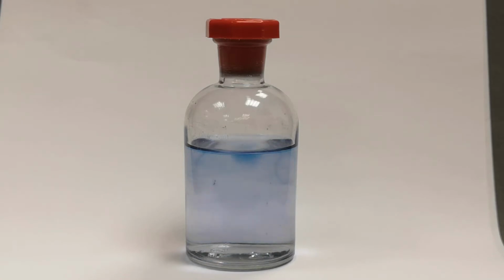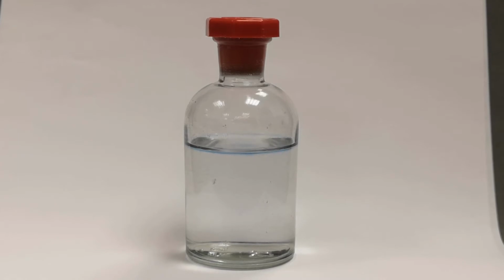If you shake the bottle though, it goes blue again. Oxygen in the bottle's headspace, above the surface of the solution, dissolves in the solution and then reoxidizes the methylene blue back to its oxidized form. On standing again it goes clear, and you can keep on shaking it and letting it stand for a fair while as it switches between blue and colourless states.